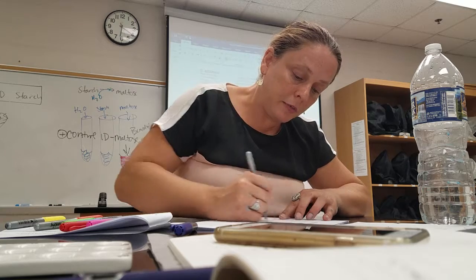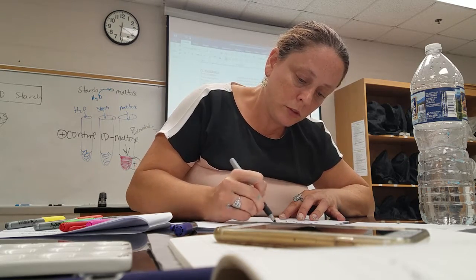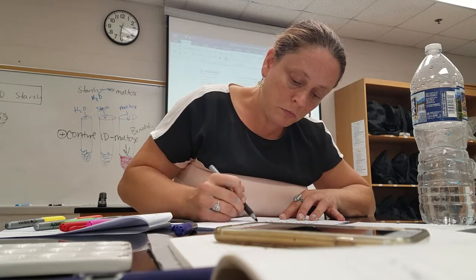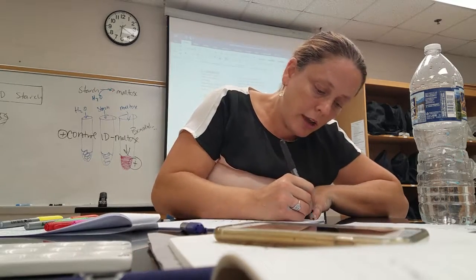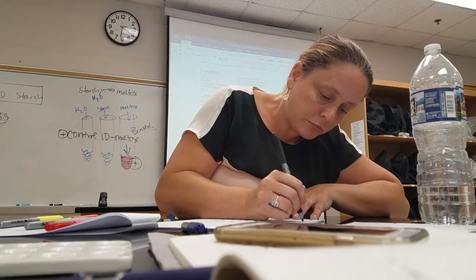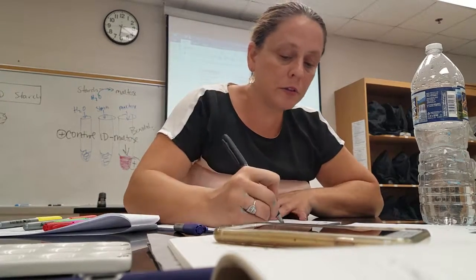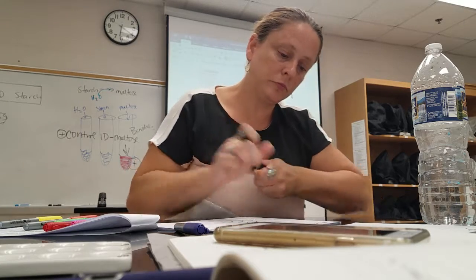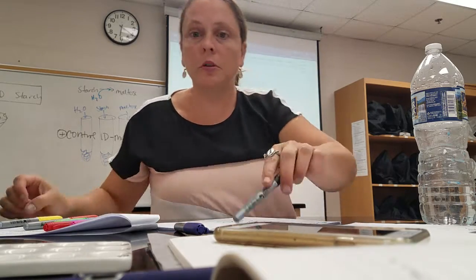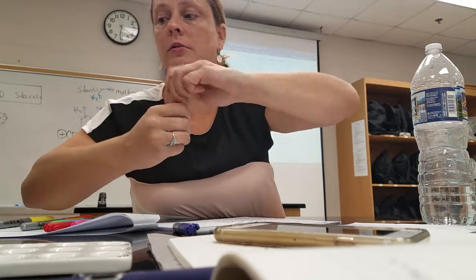First, we're going to use Lugol's using a spot plate, just because that's what we have. You could use anything, really. So this is not even your experiment. We're just learning how to detect starch. So Lugol's can be used. This is called your positive identification control for starch. You notice this is like betadine, right? And that's kind of just what it is.